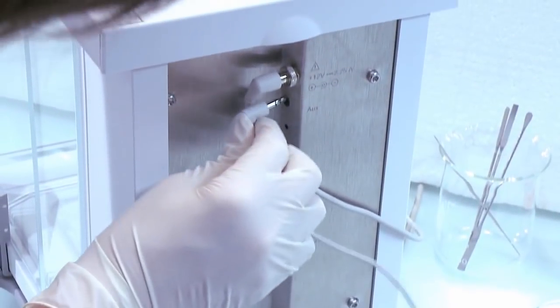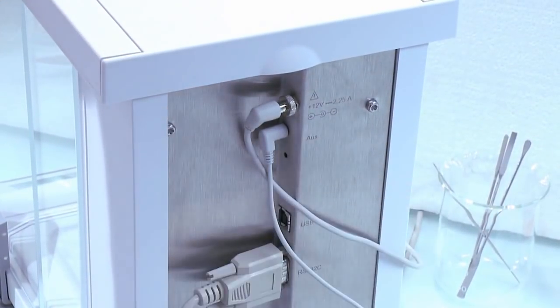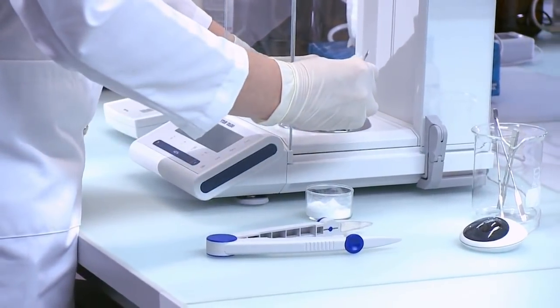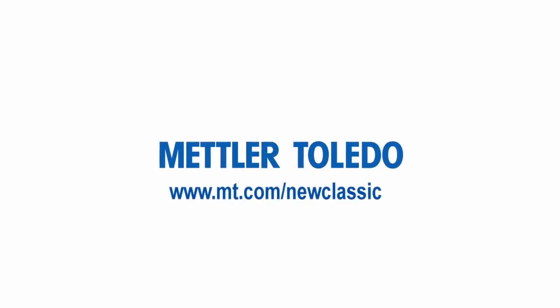sideways-mounted connectors at the back of the balance save additional space. Designed for you right down to the last detail - weighing convenience in the best Swiss tradition.